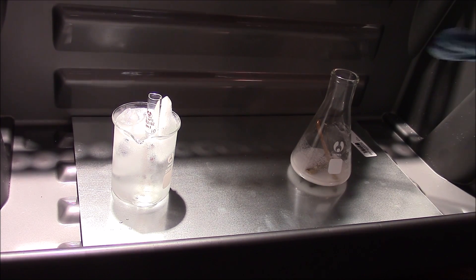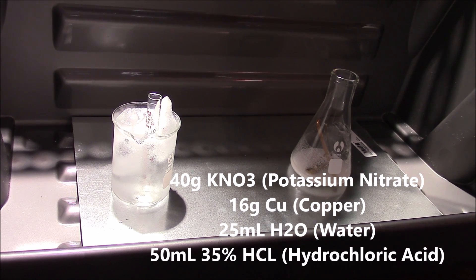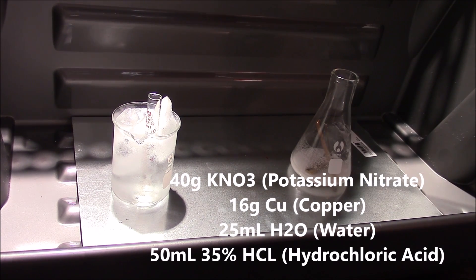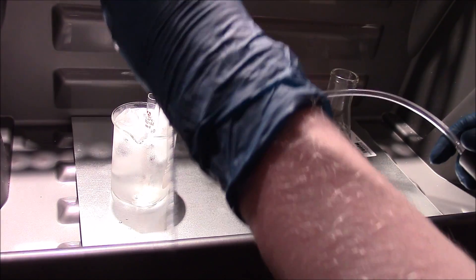Since I've only got 3% that's what we're using. In our flask we have 40 grams of potassium nitrate — you can use pretty much any nitrate salt like sodium nitrate or even a nitrate-based fertilizer, provided it has actual nitrates in it. There's also 25 milliliters of water and about 16 grams of copper. We're going to add 50 milliliters of hydrochloric acid, because what we need to do is create nitrogen dioxide gas to go into our hydrogen peroxide mixture to give us nitric acid.